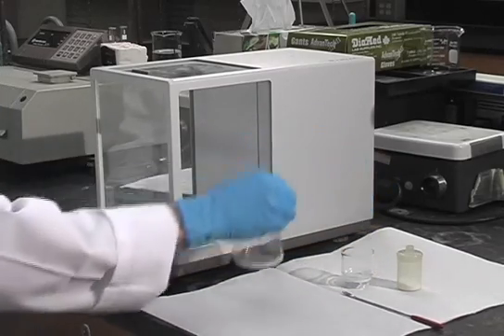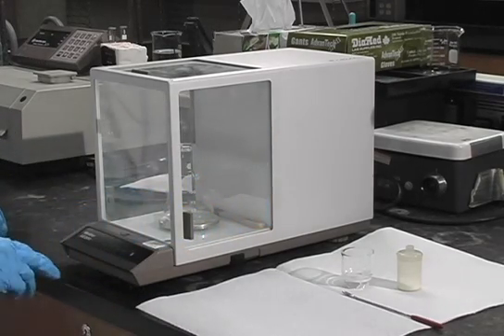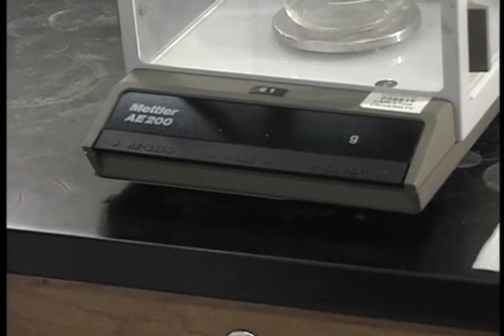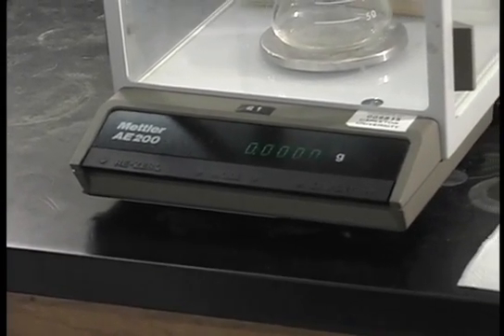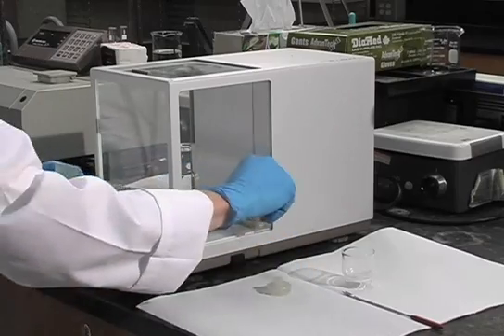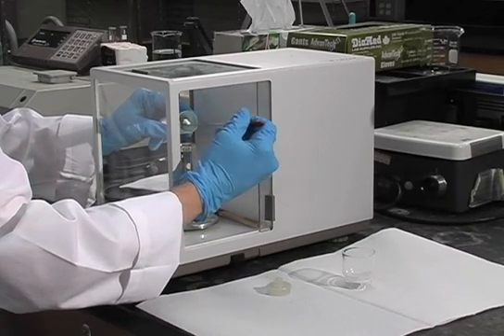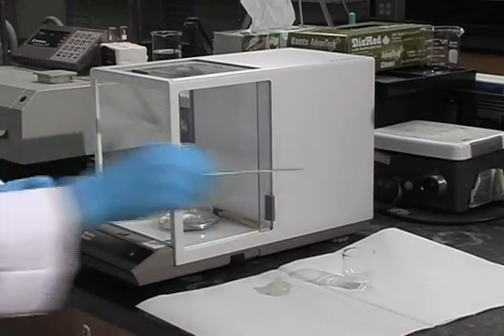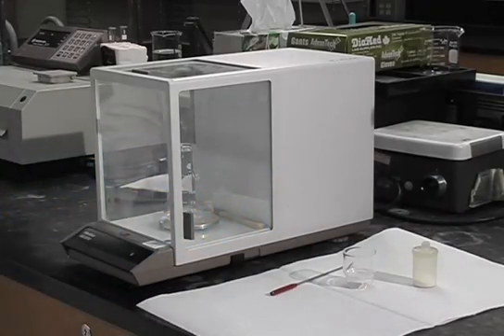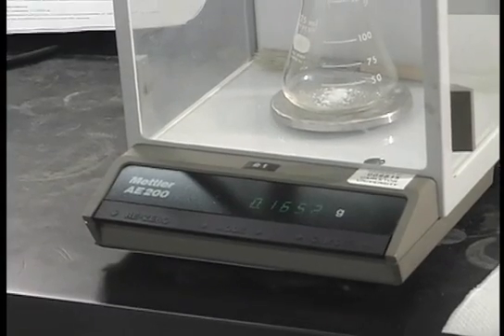The second method is if you're weighing into a container — you can actually tare out the weight of the container. To do that, you just press the control bar and that will re-zero the scale. Then you just put your substance into your flask, close the doors again, let it stabilize, and take your reading. This gives you the weight of just the powder which you've put into the flask.